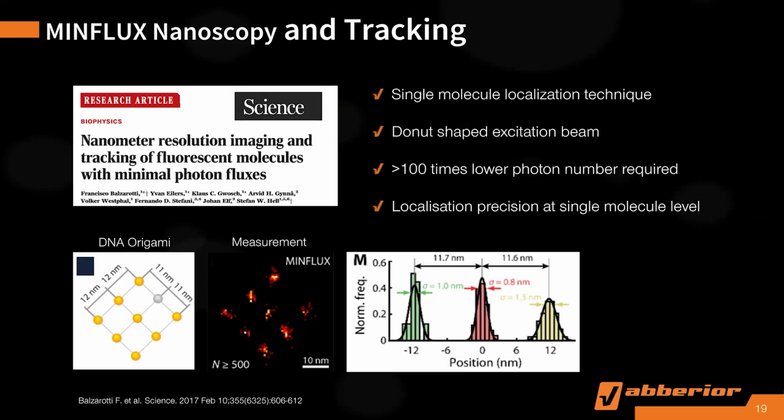So as I said, in single molecule localization the raw data is coordinates, okay? We try to localize several times for 1 molecule. It's similar to an Olympic shooting game, right? You try to shoot a target multiple times.